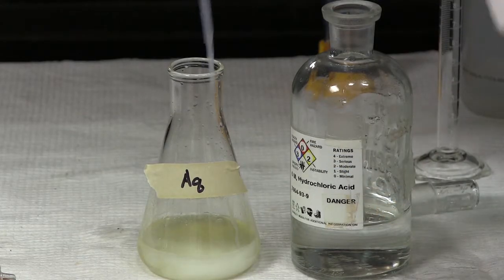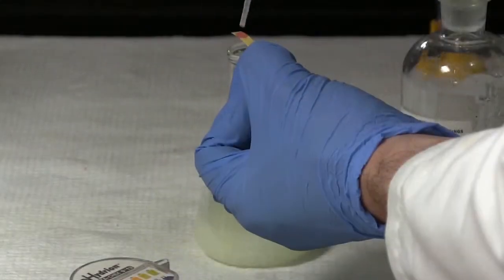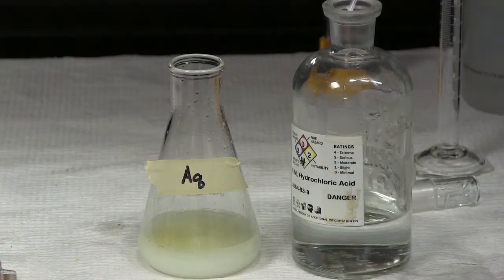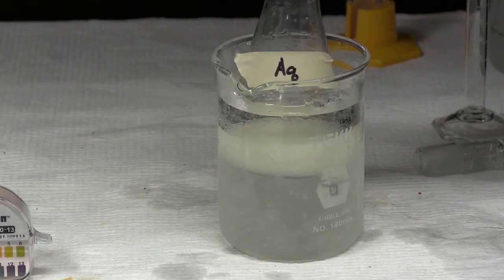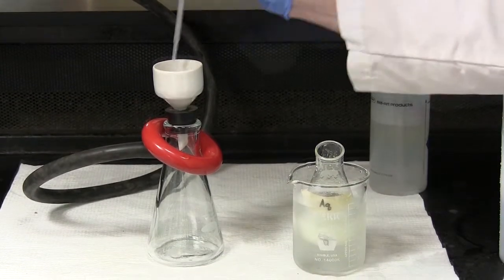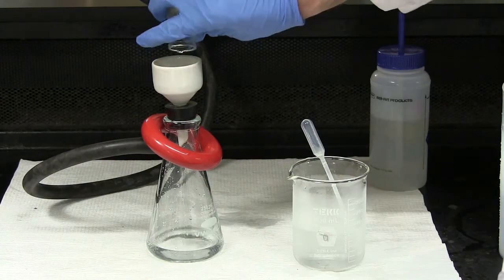Acidify the alkaline aqueous extract by slow addition of 6 molar hydrochloric acid. Use pH paper to ensure the solution is acidic. Add another milliliter of acid to ensure the precipitation is complete. Chill the mixture in an ice bath for 10 minutes. Collect the crystals via vacuum filtration. Be sure to wash the crystals with cold water to rinse off the excess hydrochloric acid.